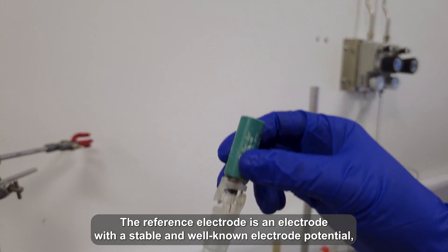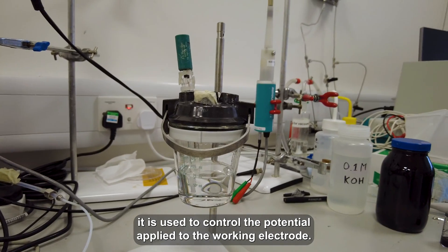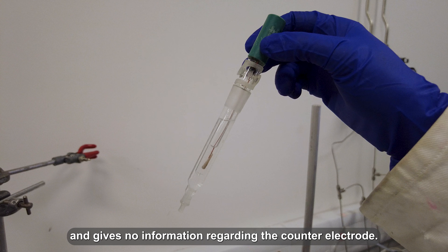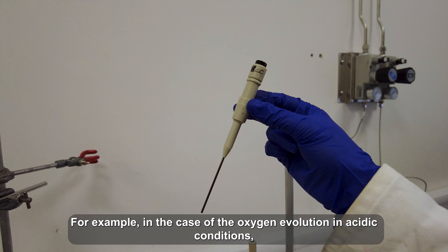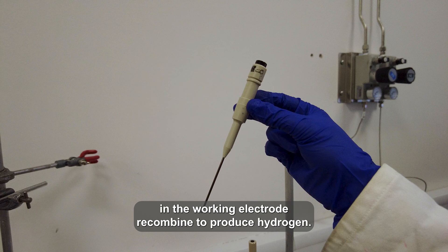The reference electrode is an electrode with a stable and well-known electrode potential. It is used to control the potential applied to the working electrode. Therefore, the potential that we measure refers solely to the working electrode and gives no information regarding the counter electrode. The counter electrode can be made of platinum, gold, or glassy carbon, and has the role of closing the current circuit. For example, in the case of oxygen evolution in acidic conditions, the counter electrode is where protons and electrons produced by oxygen evolution at the working electrode combine to produce hydrogen.